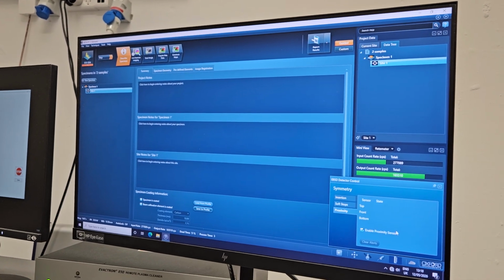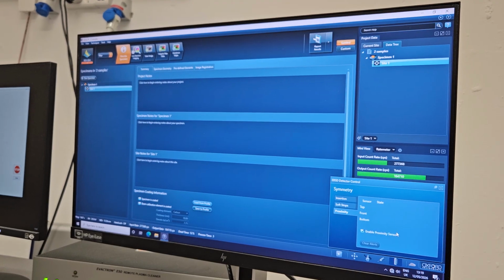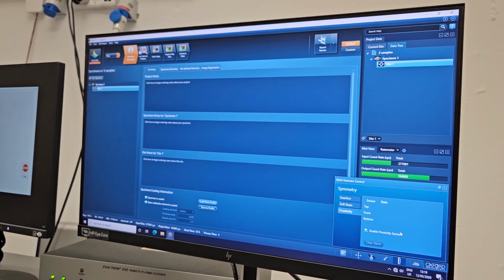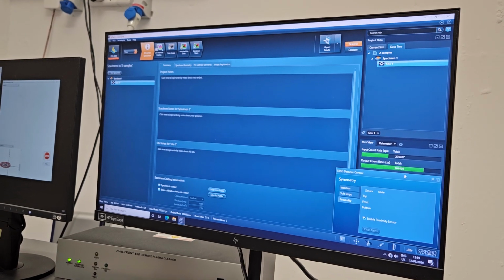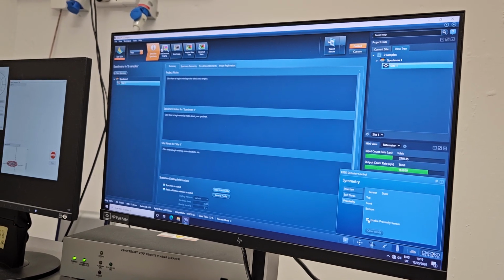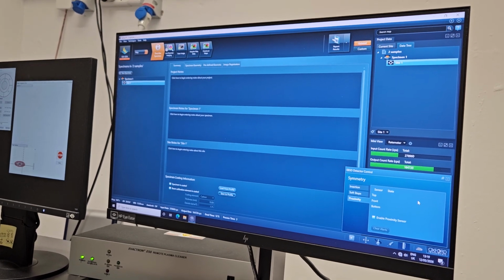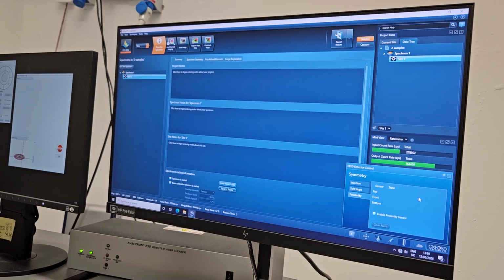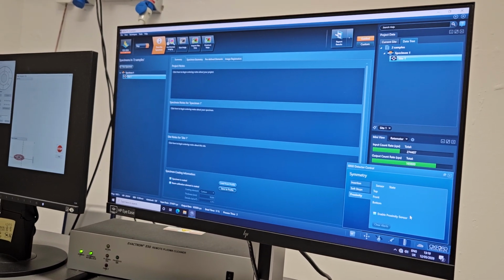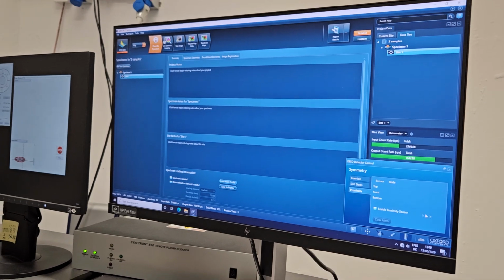But you need to have it off also when you start imaging, because it could introduce noise. So, right now, it is fully inserted, then you can disable it. If not, then you might have some problems with image quality. Okay, so important. Recommended, yes.